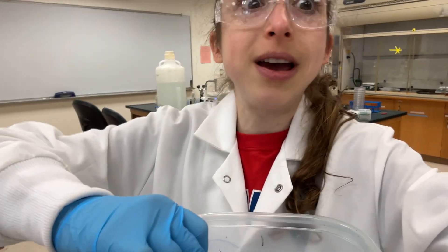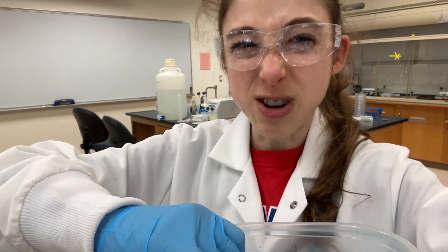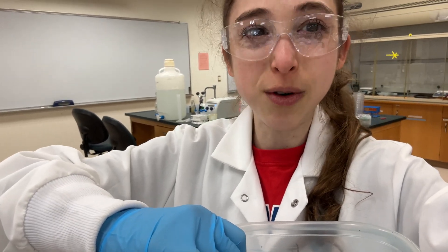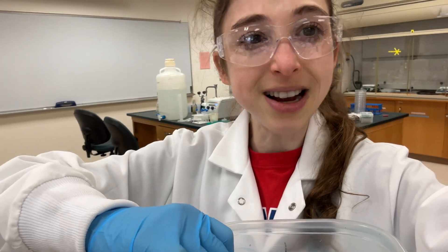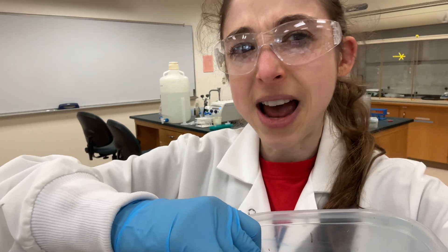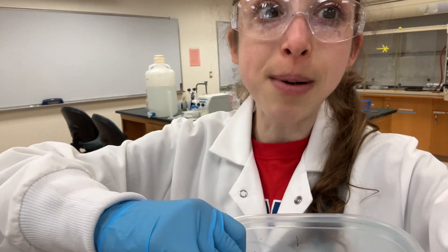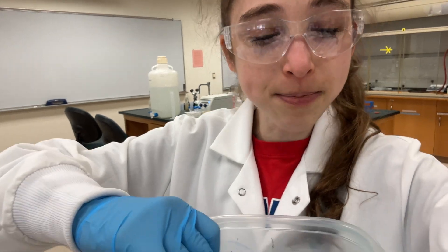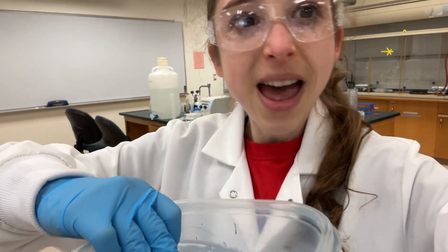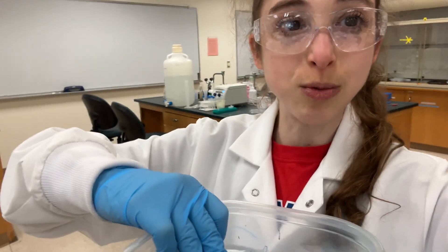So instead of trying to purify it out of Bacillus defensis, we put it into bacteria that are really good at expressing proteins — even modified proteins — so we stuck it into E. coli cells. We stuck the instructions for making that protein with a histidine tag on the end, basically a string of the amino acid histidine, which let it bind to a nickel-coated column resin. Then we let it flow through, let other stuff come out, and then we wash and wash and wash it.